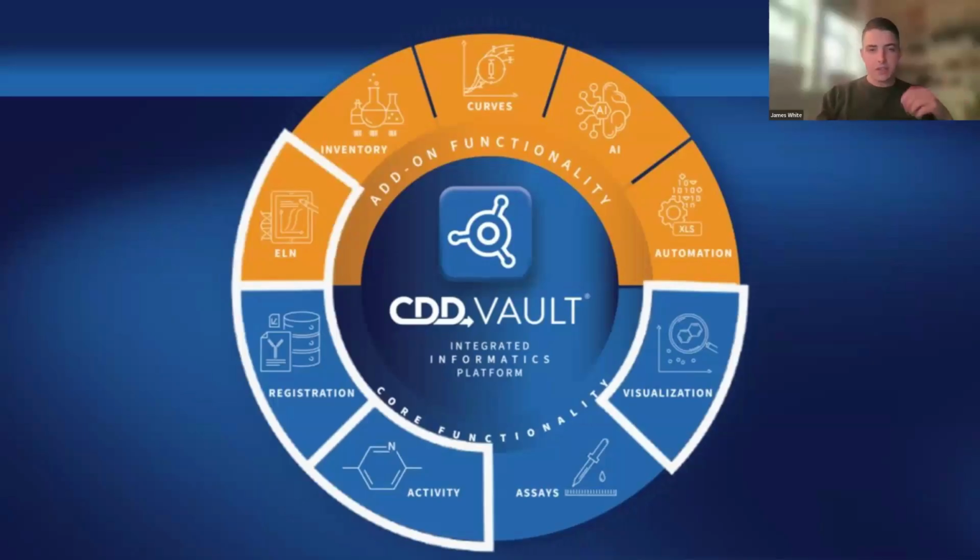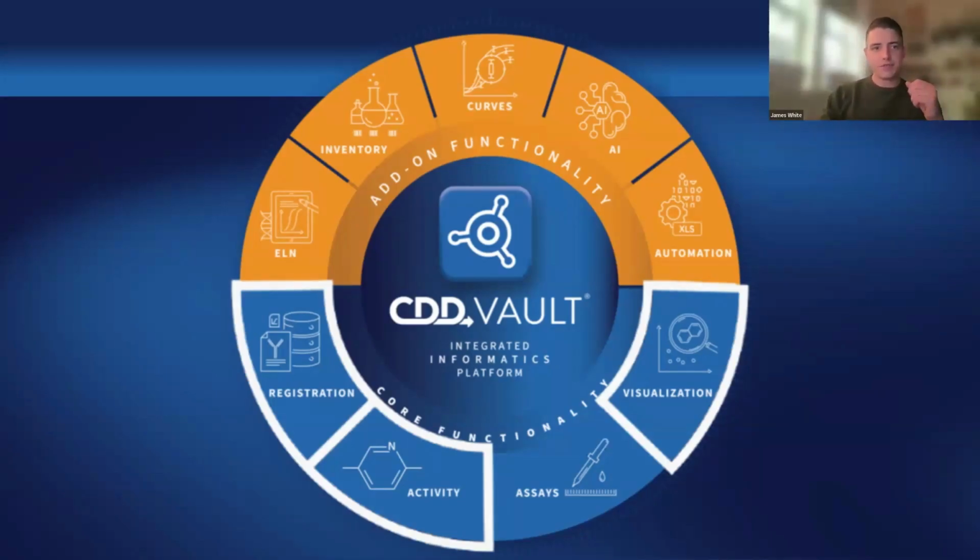So let's kick it off with the latest developments in biologics and bioconjugates. These are playing a much larger role in modern research, and the industry is expanding, so we've brought those tools into CDD Vault so that you'll be able to take advantage of them. We've added intuitive registration for complex biologics, including antibodies, peptides, as well as bioconjugates, flexible representations of the linkers, payloads, and modifications on those bioconjugates, as well as clear visualization of the constructs, enabling you to review and share those structures at a glance for streamlined collaboration.